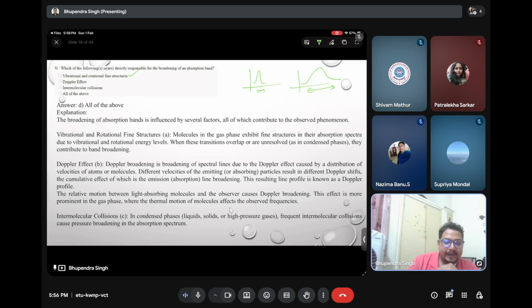So, like the atom or the molecule, if you excite it, it is emitting or absorbing. These atoms or the molecules are actually absorbing or emitting at different wavelengths. So that is why the broadening is coming, because the velocity is different. So they are not reaching the detector. Even if it is the same wavelength, the time taken for the photon is different.